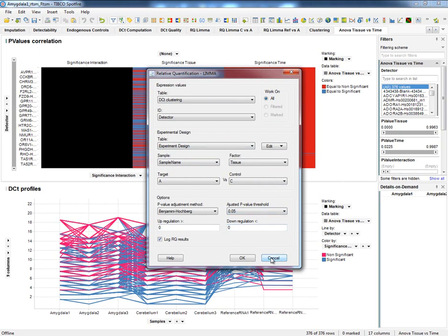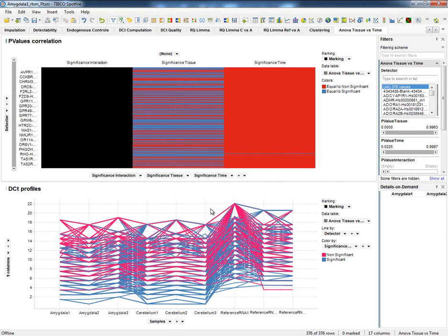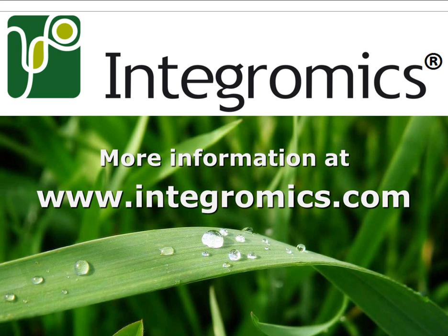So, we're finished. In this tutorial, we've talked about how to define our experimental factors, how to deal with technical and biological replicates, and finally, how to create new experimental factors that can be used in the context of deep statistical analysis. The next tutorial describes the next step in our analysis, how to configure the settings of the workflow before running the click-and-go automatic analysis.